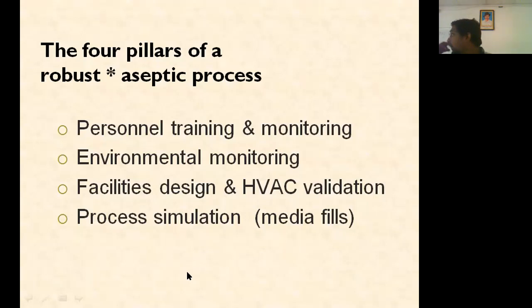Our hair can carry a lot of microorganisms, right? Our skin can carry a lot of things. Our dress and our shoes can carry a lot of infectious substances. Even though everything, raw material, finished product, containers, closures, water fountain, was good and sterilized, the person who is doing that particular work, the people involved there, if they are not sterile, if they are not perfect, if they become the carriers for the pathogens, then no one can help them.